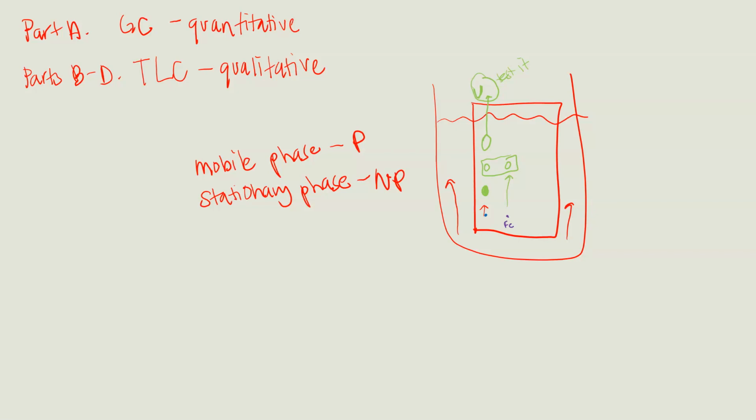We're not going to get into details on how exactly a gas chromatography instrument works, but for any of you that have to go on or want to go on to take quantitative analysis, which is a course that is offered in the fall at St. Charles Community College, it's analytical chemistry. You get to learn more about all of this gloriousness. Okay, so that's kind of the background, the idea of what we're doing here, what chromatography is.